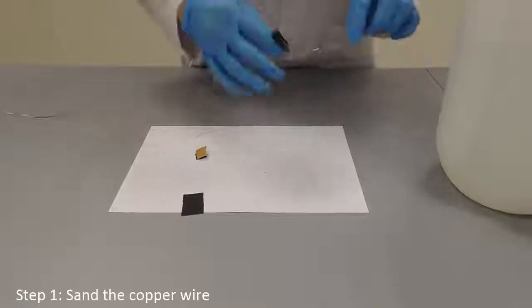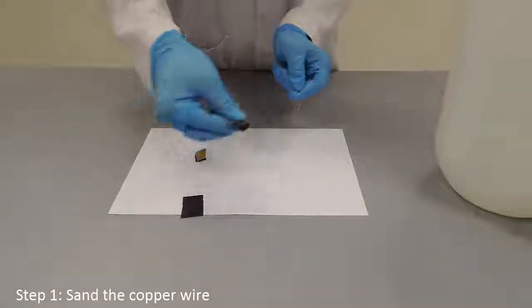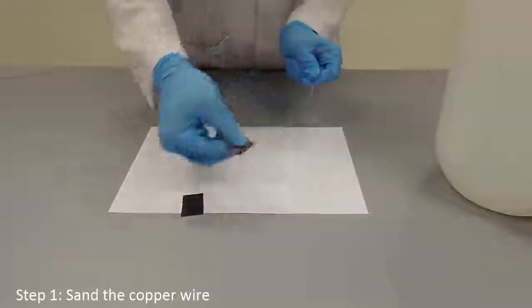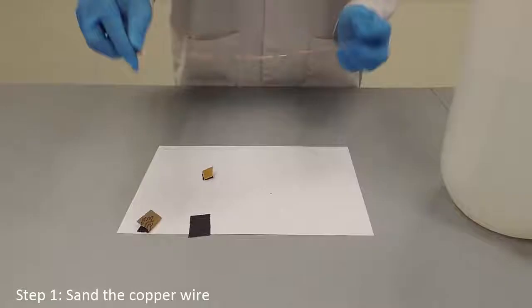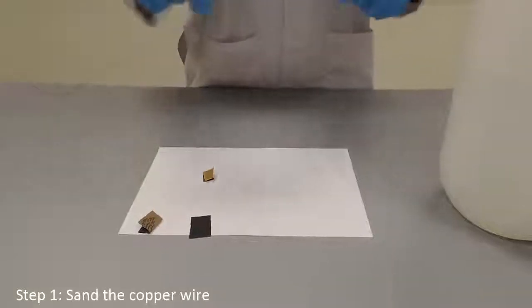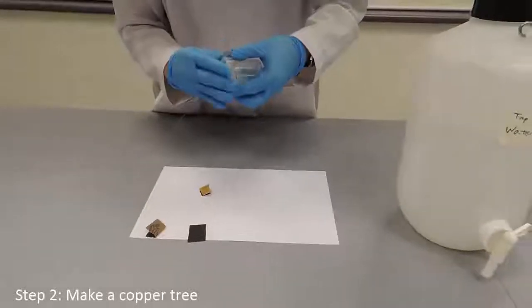The first step of the experiment is to sand the copper wire. This step is carried out by scraping off the top layer of copper to increase the surface area of the copper wire for more interaction with the silver nitrate solution. This will greatly speed up the formation of silver crystals on the wire.